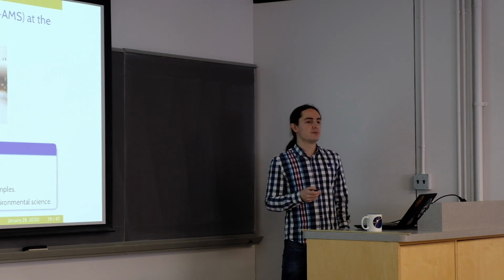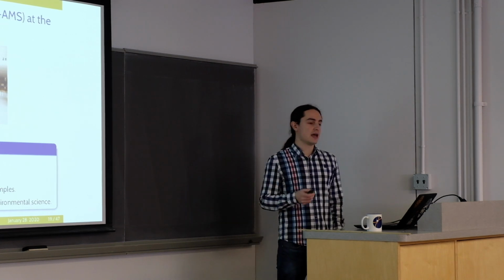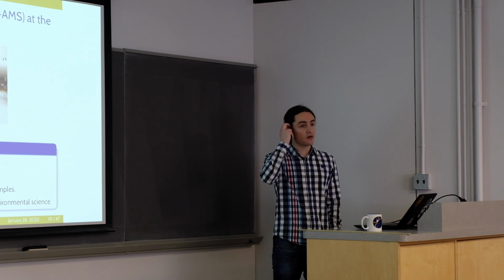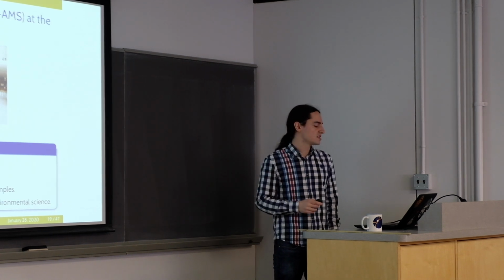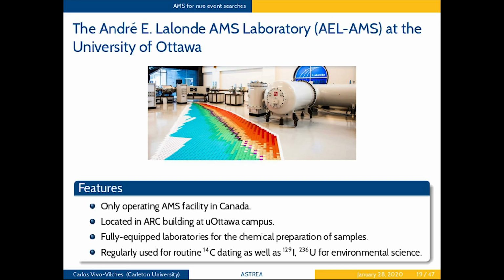All our measurements are being performed in the André E. Lalonde AMS Laboratory, which is at the University of Ottawa, in the main campus of the University of Ottawa. It's the only operating AMS facility in Canada, so it's pretty convenient for us at Carleton to have this facility in the same city.